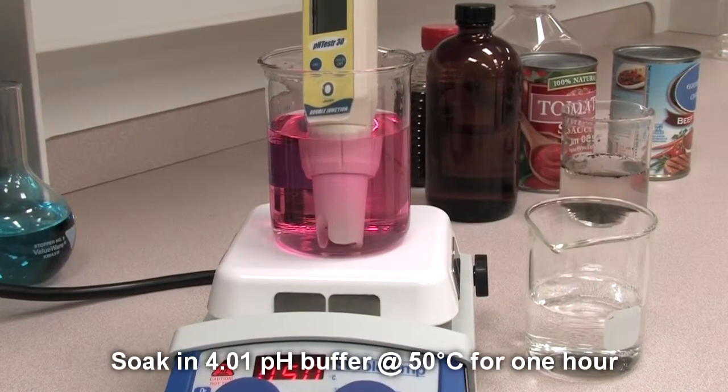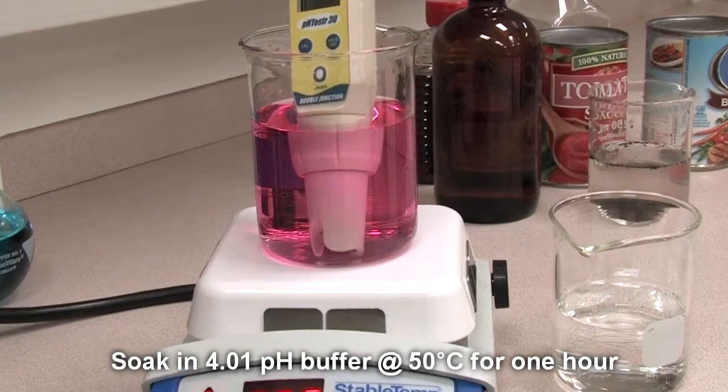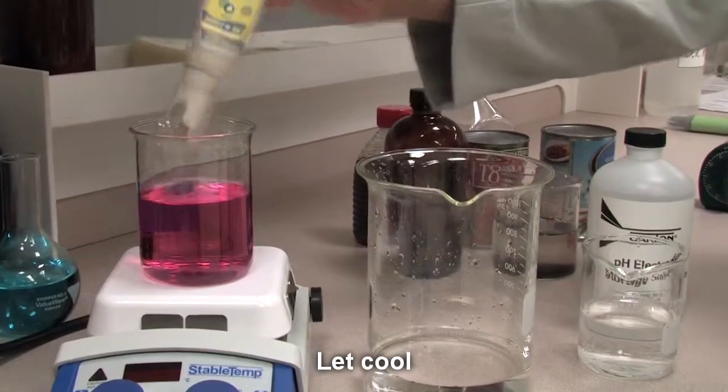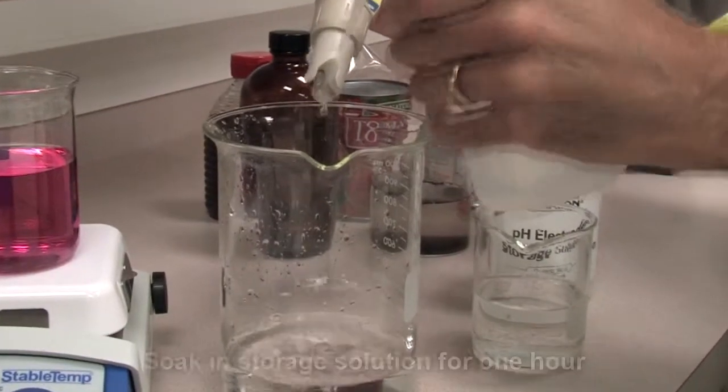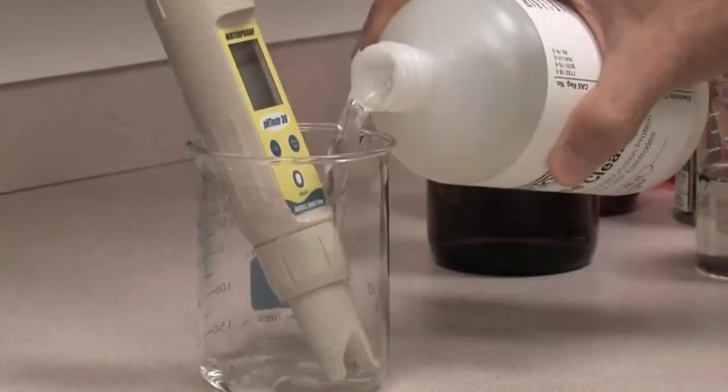Soak the electrode in a 4.01 pH buffer solution heated to 50 degrees Celsius for 1 hour. Allow the buffer to cool down to room temperature, then rinse the electrode with deionized or distilled water and soak for 1 hour in storage solution.